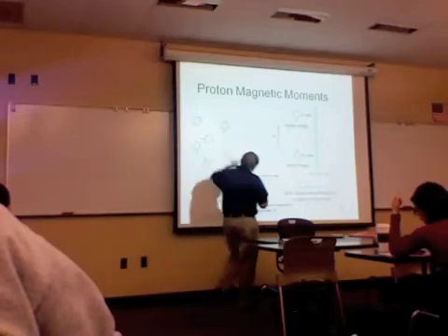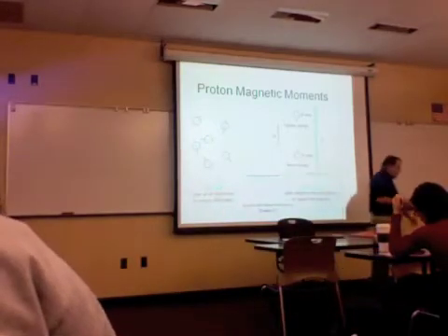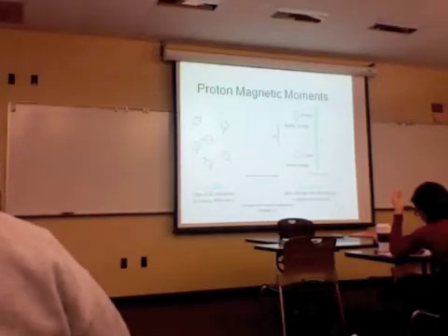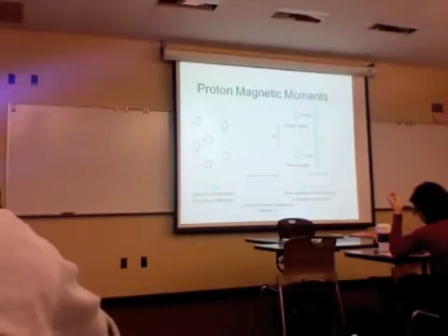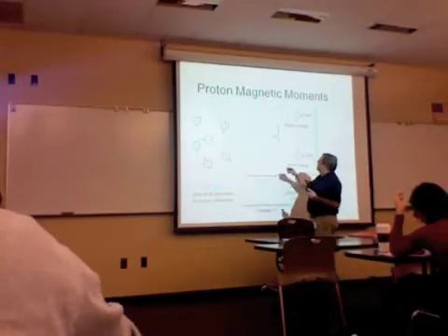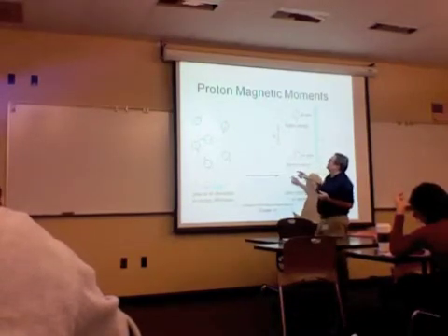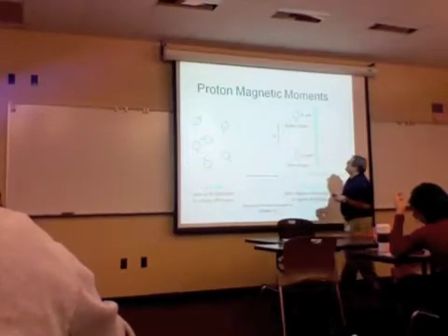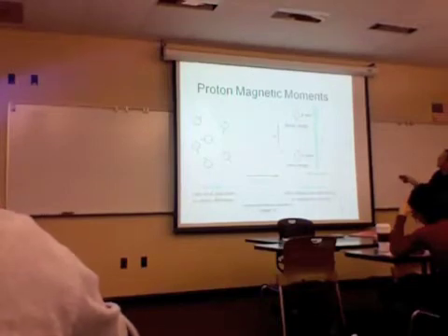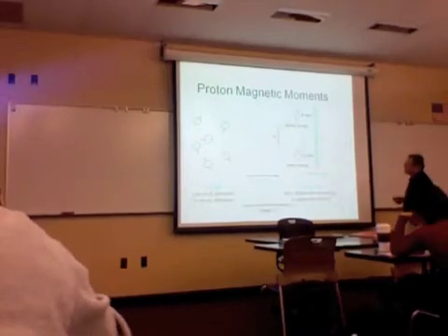So here we have a number of hydrogen atoms, and let's use hydrogen as an example, that are spinning in random directions because there's not a sufficiently strong magnetic field applied to them. Then we apply the powerful magnetic field and we actually create the two states. The beta state, which is in opposition to the applied field, and the alpha state, which is in line with the applied field.